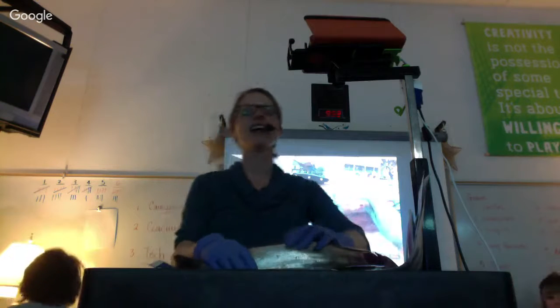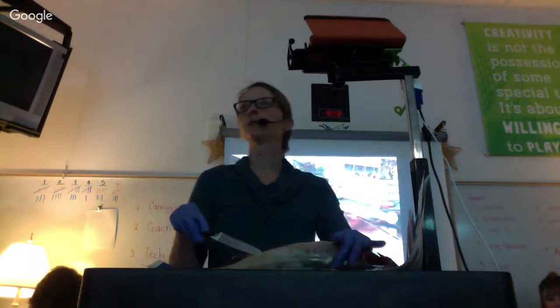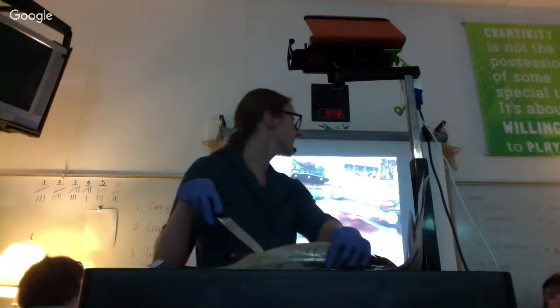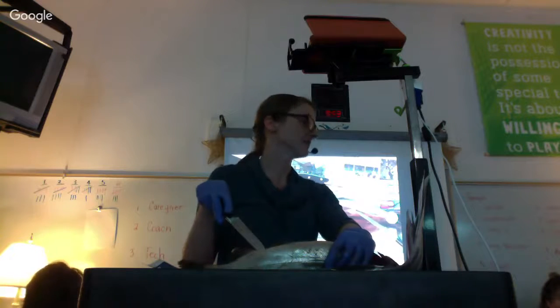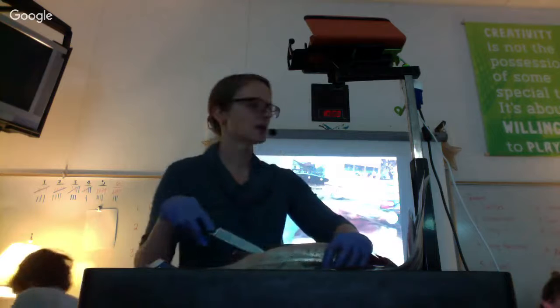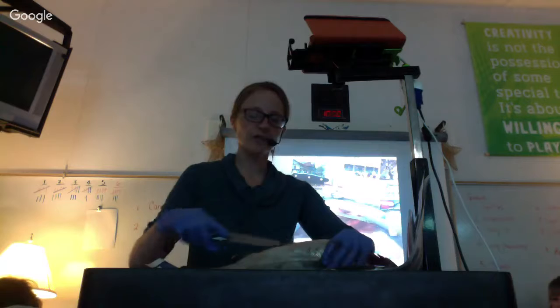A girl. Okay, and 5, 4, 3, 2, 1, and 0. Okay, and everyone should be silent. Still waiting for sanitizers. Sanitizers, you need to sit down. Okay? The adult is cutting. Children are not cutting. Students aren't cutting. Okay? So the adult will be cutting all the way down the bottom.